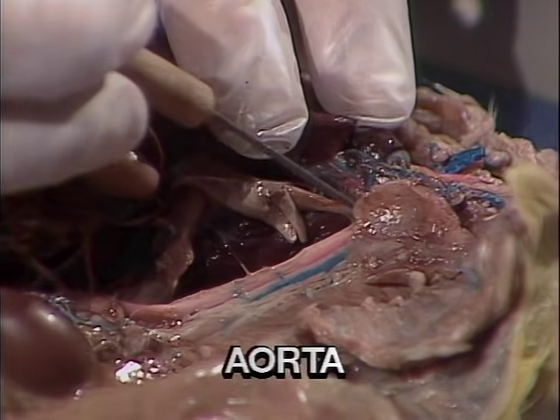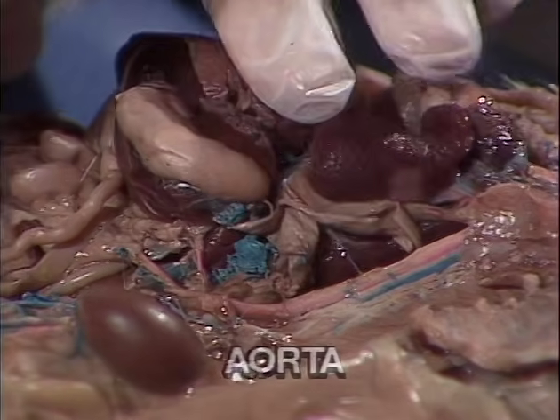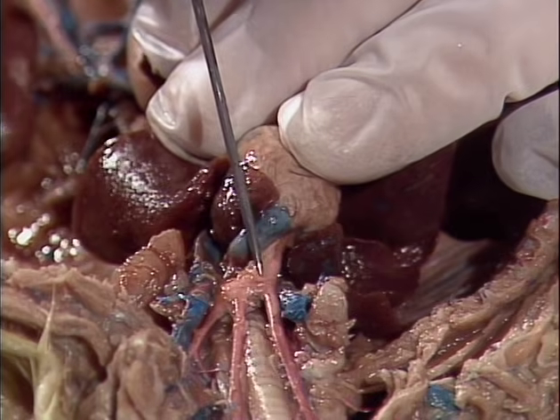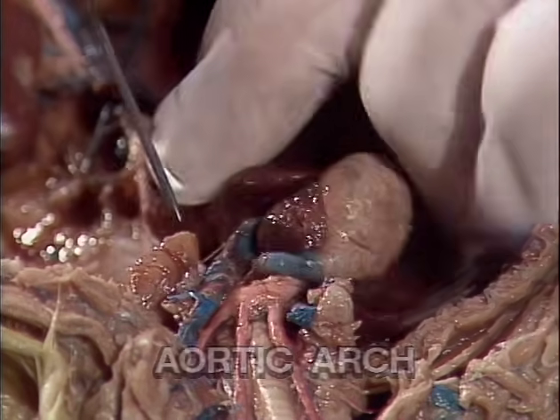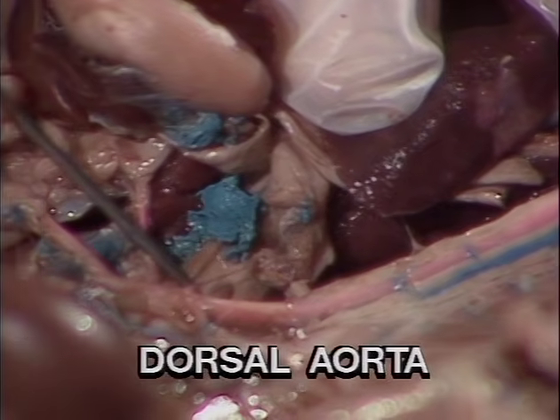This is known as the aorta. It is the major artery in the rat's body. The arch that is formed as it comes out of the left ventricle is known as the aortic arch. And as the aorta passes down the back of the rat, it is known as the dorsal aorta.